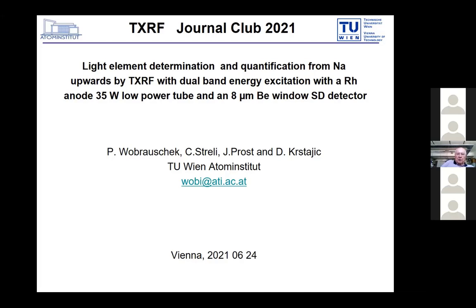It is possible to show that even with an 8 micron beryllium window STD, we can do such measurements.